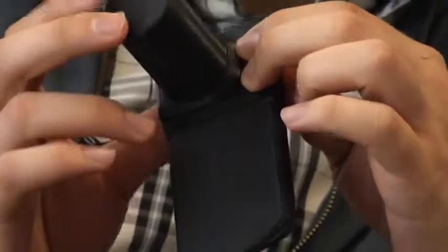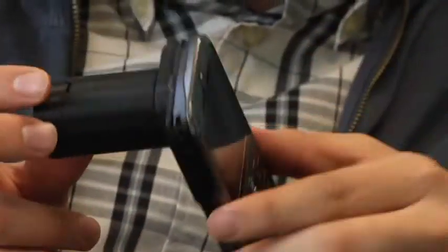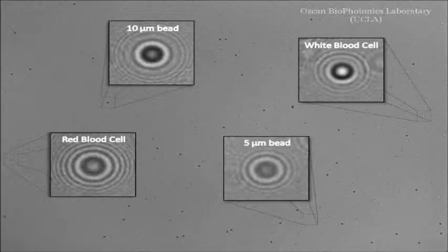What we have in here is actually a microscope that is working based on computational imaging. Essentially, it is a microscope that doesn't use lenses. So the lens function itself is replaced by algorithms creating digital images of specimen at the micron scale, at a scale that is smaller than 1/1,000,000th of a meter, to look at morphology of cells.